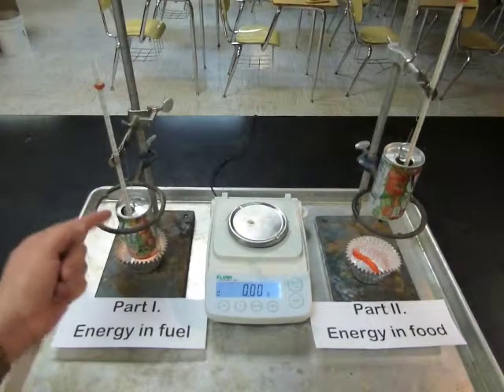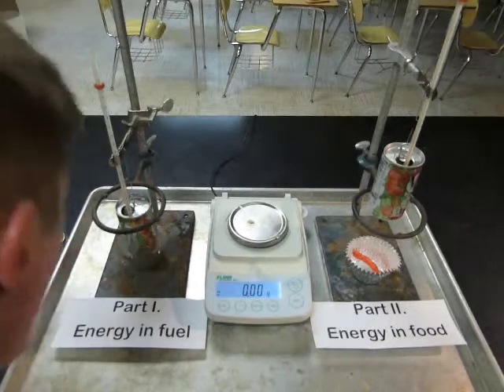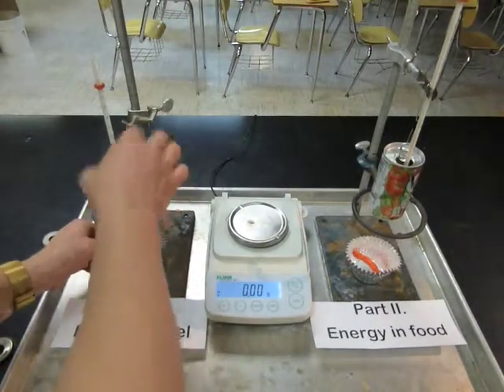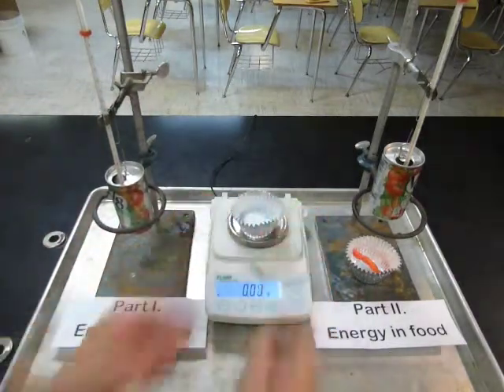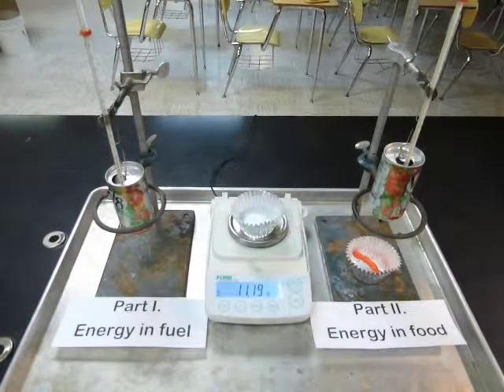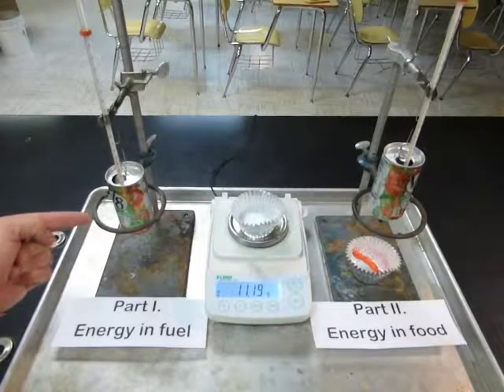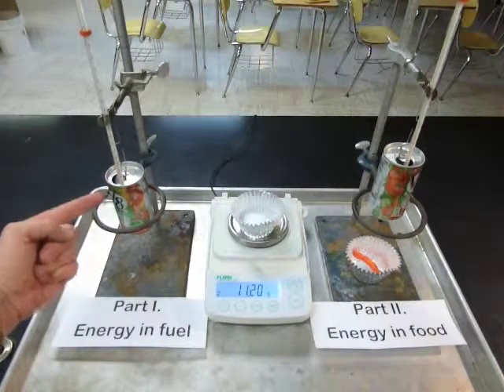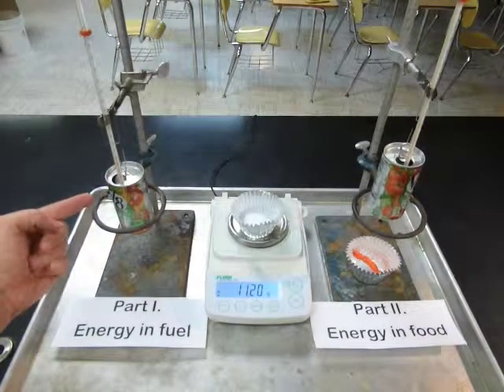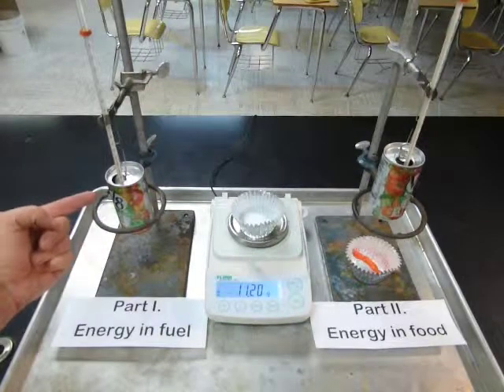Once the temperature has reached the high point that you're looking for, then you can blow out the flame, and you can put the material back on the balance and reweigh it. It should weigh less than it weighed before. Subtract to find out how much fuel was used, and then we'll do calculations to find out how much heat was exchanged. We'll have to account for 2 things that are exchanging heat with the candle. One is the aluminum can, and the other is the water that's inside. So we'll do a calculation for heat exchange with both of them, and then we'll add them together to get the total result.